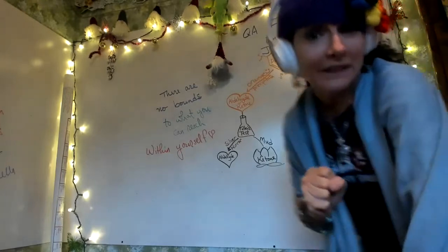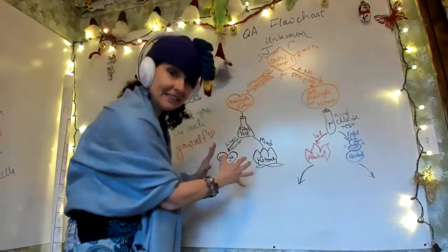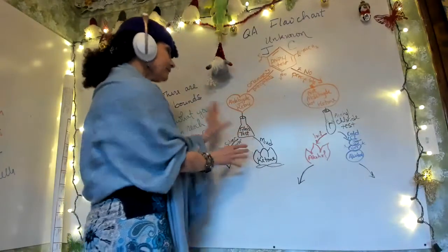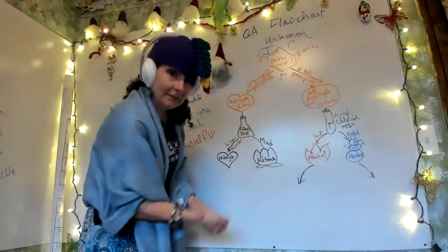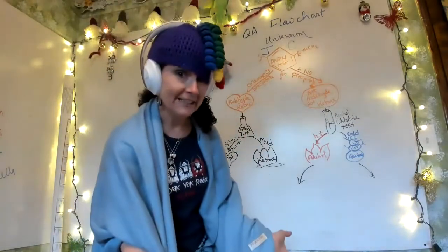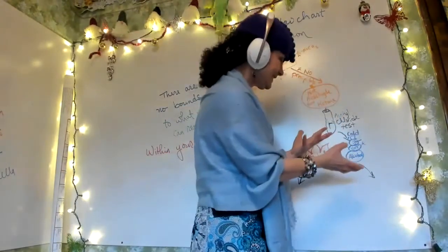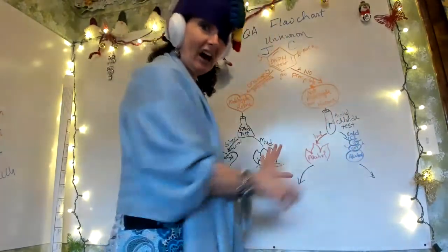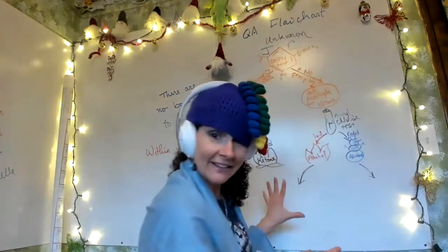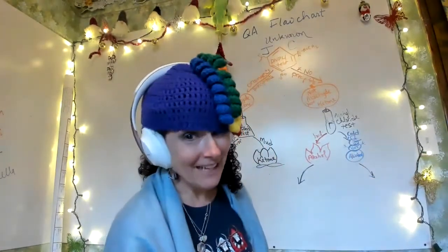So from there, we do one of two things. If we do have an aldehyde or ketone, we then went to the Tollens test. And from that, we either had a silver mirror or we had mud. Silver mirror meant an aldehyde, mud meant a ketone. No precipitate, well, then we did the acetyl chloride test. And we either got hot or cold. Hot meant we had an alcohol, and cold meant not an alcohol.